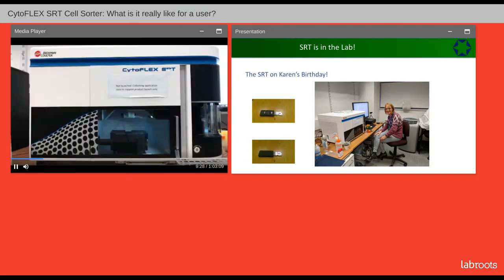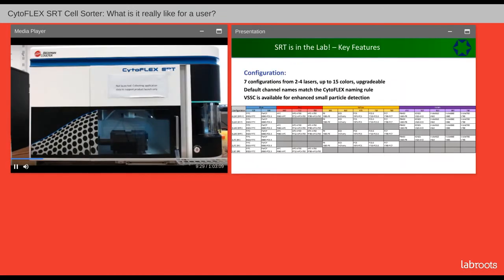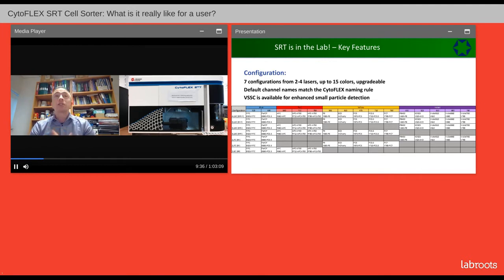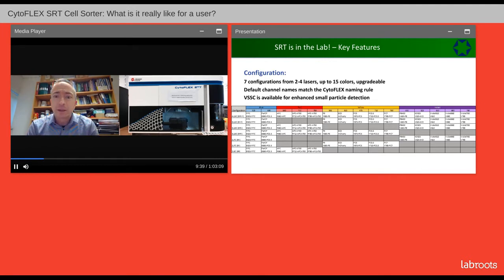Now the quality control beads are the Cytoflex daily QC fluorospheres — the same beads as anyone used to a Cytoflex analyzer would know. We have to choose the QC beads lot number because the target gains are lot specific. I'm going to click start now and the QC will commence and the sample chamber will be pressurized. Right now I'm going to pass you back to Pete to walk you through the lasers and detectors within the system.